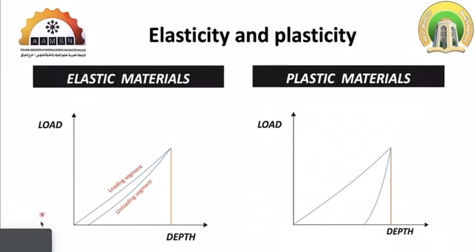If we think about this curve, this is the maximum penetration depth, and when we lift the indenter from the surface, this distance decreases with the load until it reaches a final point. It is different for every single material, as I will come to in the coming discussion.